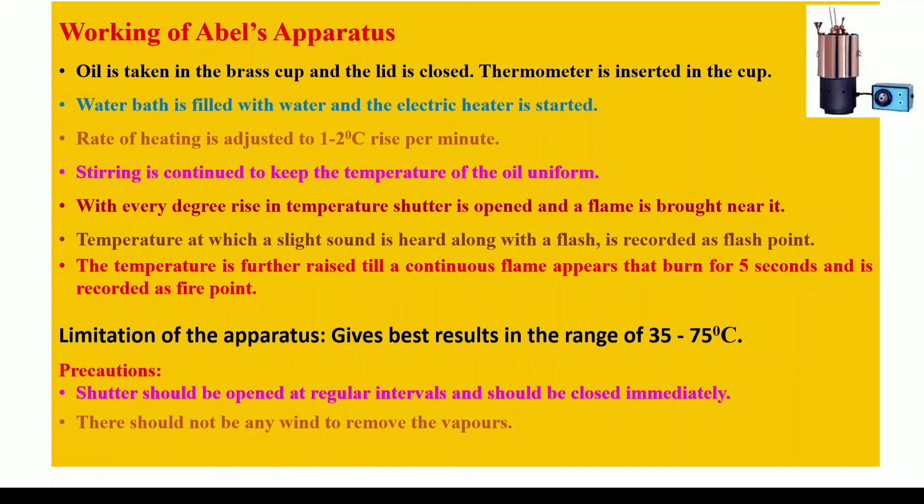Once the flash point is recorded, keep raising the temperature using the electric heater and don't stop stirring the oil. Record the fire point using the same technique as for the flash point — by sliding the shutter and opening the mouth of the brass cup — until you see a flame burning for at least 5 seconds. This temperature is recorded as the fire point.